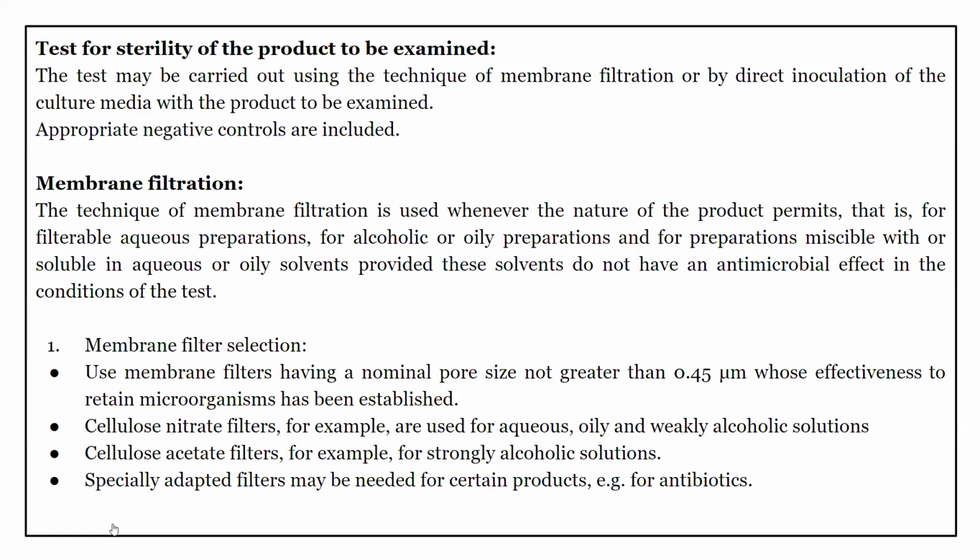Now we'll start with membrane filtration. The technique of membrane filtration is used whenever the nature of the product permits, that is, for filterable aqueous preparations, for alcoholic or oily preparations, and for preparations miscible with or soluble in aqueous or oily solvents, provided these solvents do not have an antimicrobial effect in the conditions of the test.